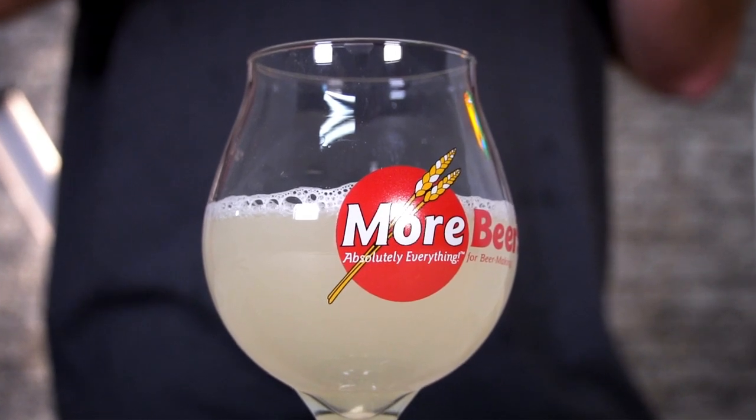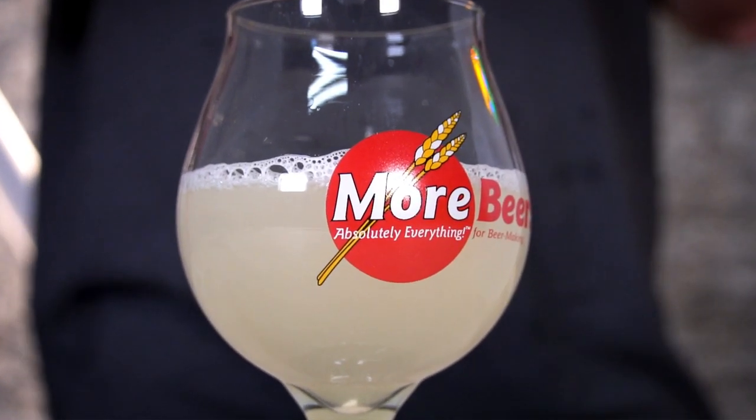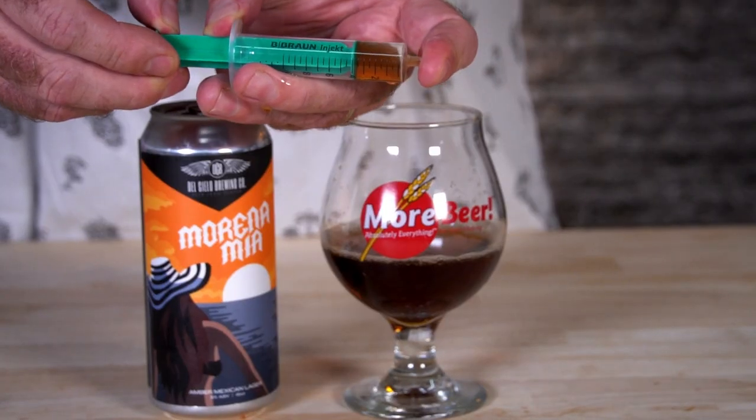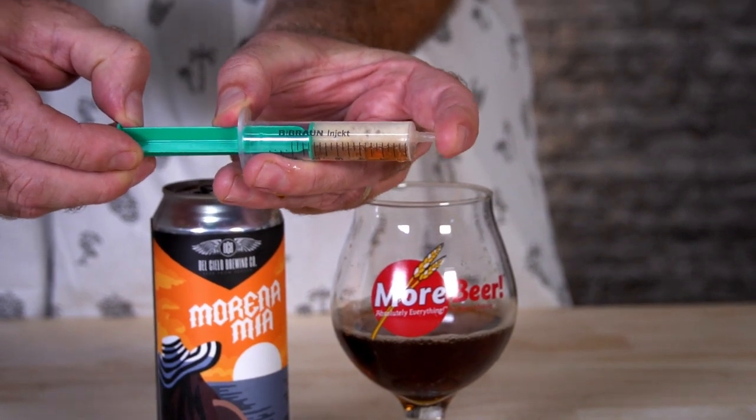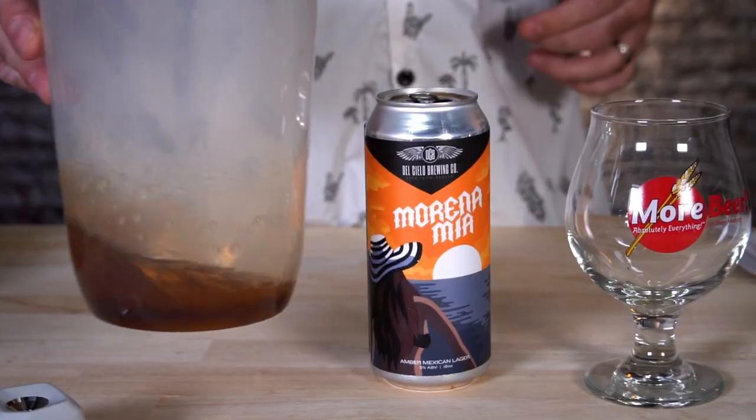One thing to note: if you're taking measurements of wort, you don't need to worry about degassing it. But if you're taking a post-fermentation or even finished beer reading, you need to make sure you degass it. There are a couple of ways to do that — take the syringe, pull it back, take your solution, let it warm up, stir it. Make sure whatever you're taking a measurement of is degassed.